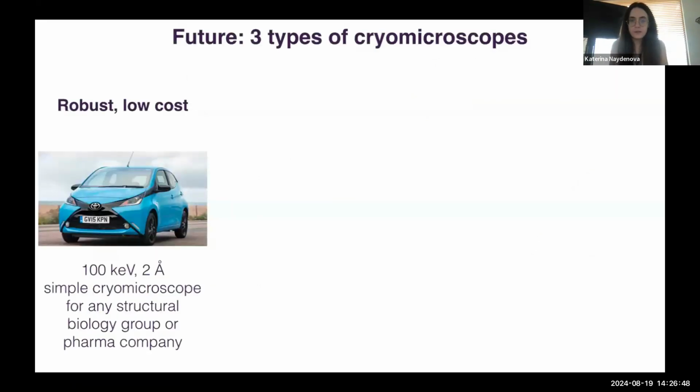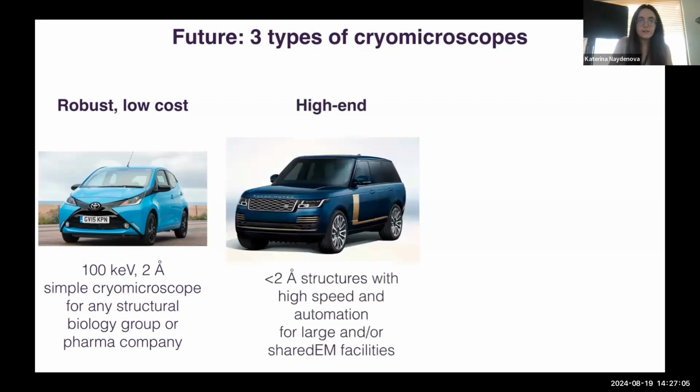So this is how we imagine the future of the cryo-EMs. We expect that every lab around the world or every pharma company will be able to have a robust, low-cost 100 keV microscope capable of reaching resolution around 2 angstrom routinely. Then, of course, there will be the high-end microscopes that will be mostly at the large facilities or the shared facilities.